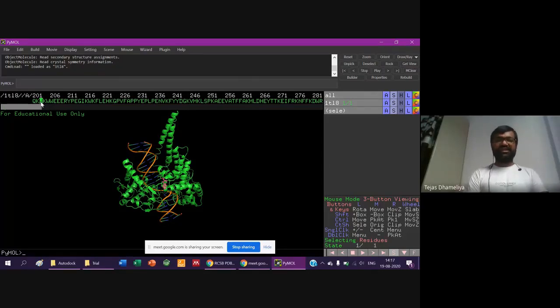So how can we identify the others? We have to look at this. First, 256 is here, another amino acid. I'm checking this, so it will not be displayed in the workspace. This is 251, so the initial letter 2 is vertically aligned with P. This P will become 251.